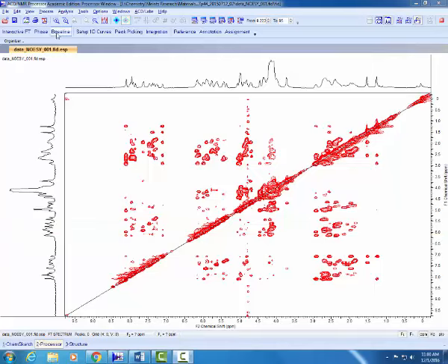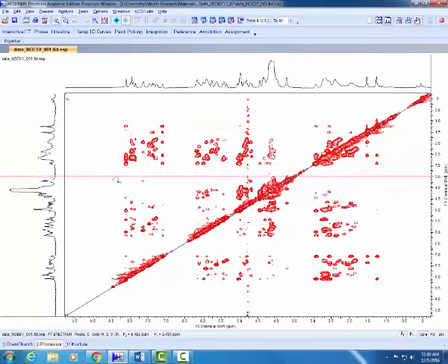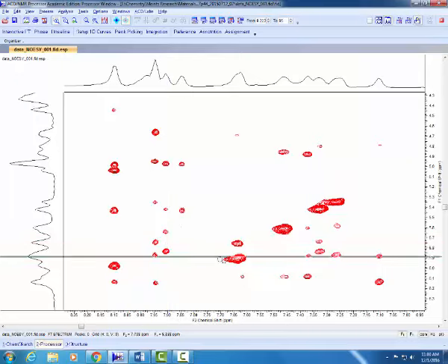The 1' region is located directly under the 2' to 2" region, so the same x-axis but a shifted y-axis, from about 5.25 to 6.25 ppm. We can start at T7H6 or T8H6 because we already know the shift of those bases.